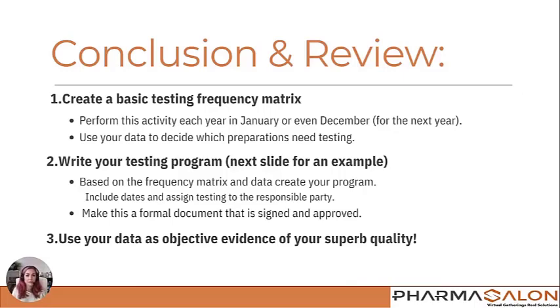All right, let's do a little quick review. I know that was kind of a lot of information really fast. All right, we want to create a basic testing frequency matrix. It's a good idea for you to perform this every year in January or even December for the next year, and then use your data to decide which preparations need testing. From this information, you'll write your testing program. We'll look at an example on the next slide.